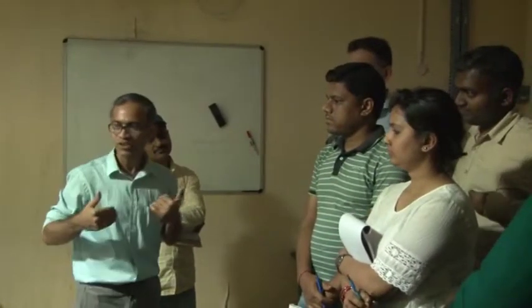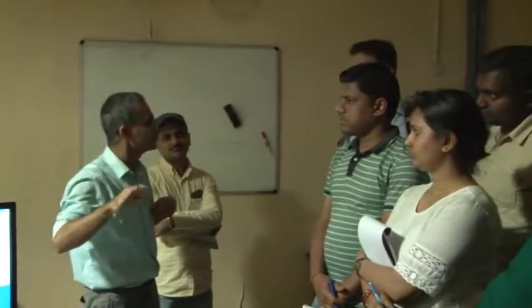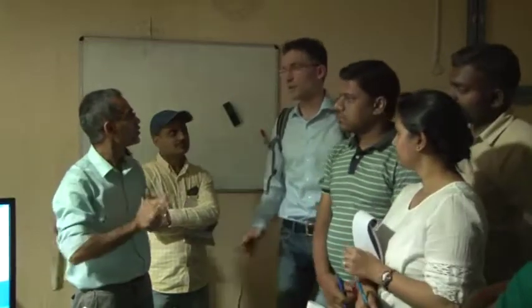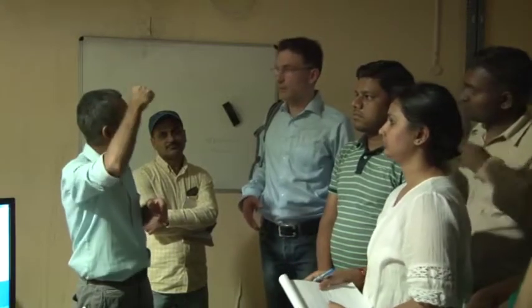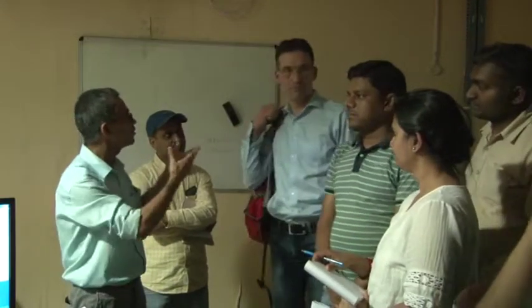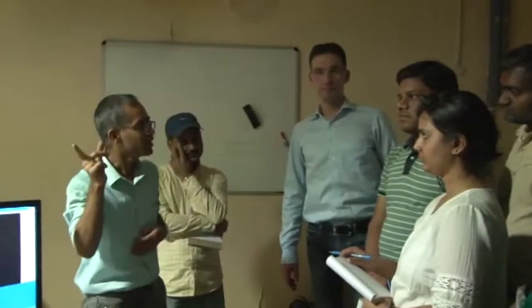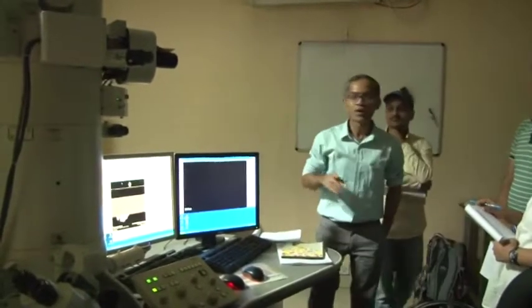There is also some discussion regarding STEM alignment. The JEOL local representative engineer has come, and he was saying that the detectors are a little misplaced. But that is no big deal. I told him last time that it's displaced. No, but this one is a different person, 2-3 days back. But he also realized that it's displaced. Maybe you can explain a little bit. For the STEM part, we are going to rely directly on him. And good. So what I have done is I have explained the components of the instrument. Okay. So great.